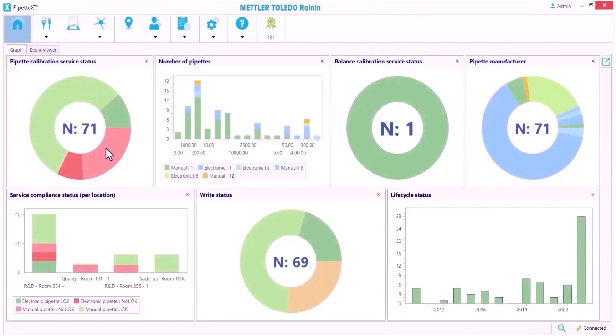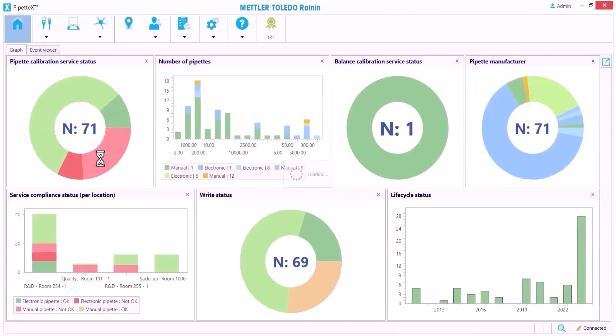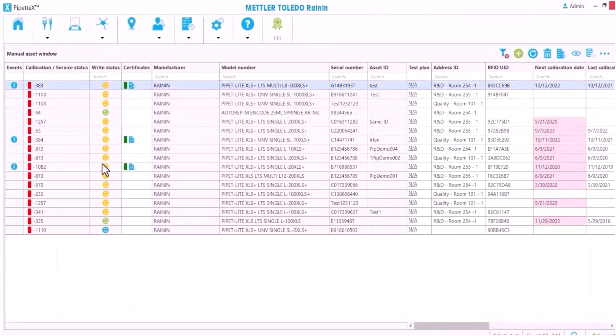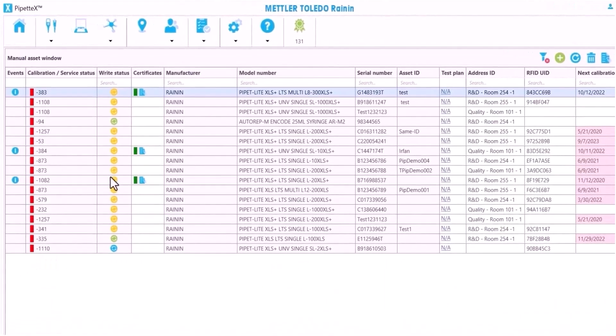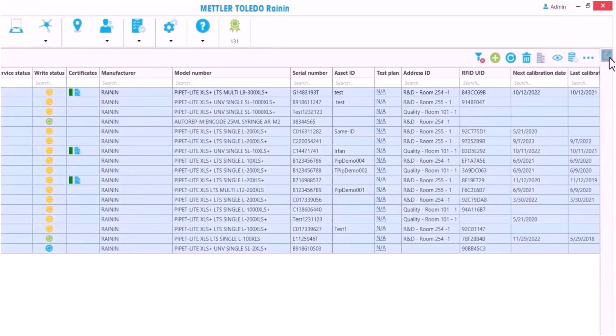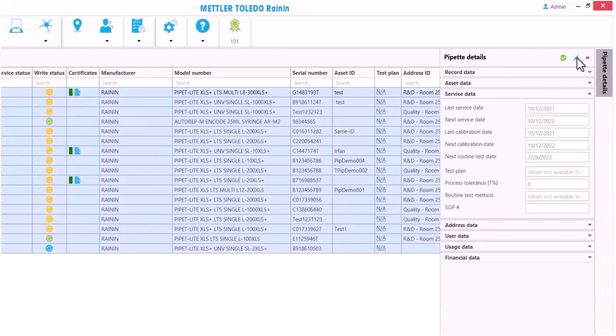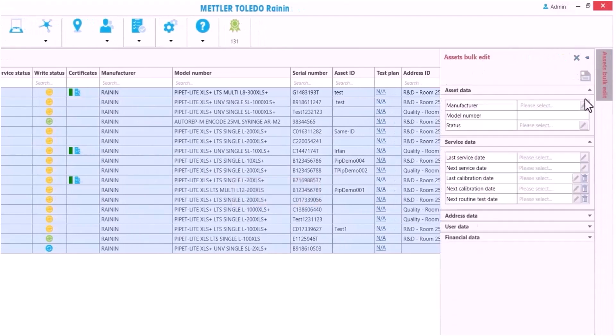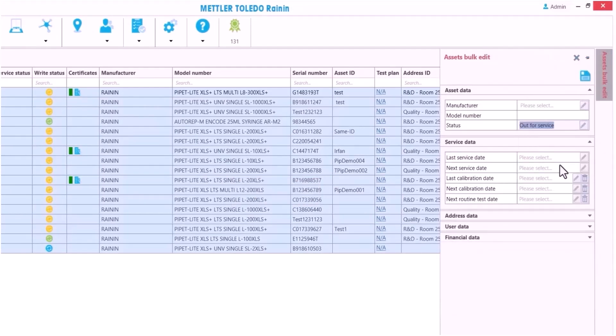I can click a color in a chart to sort by calibration status. All these pipettes are overdue for service, so I select all and click the pencil to batch edit. Then I set them to out for service.